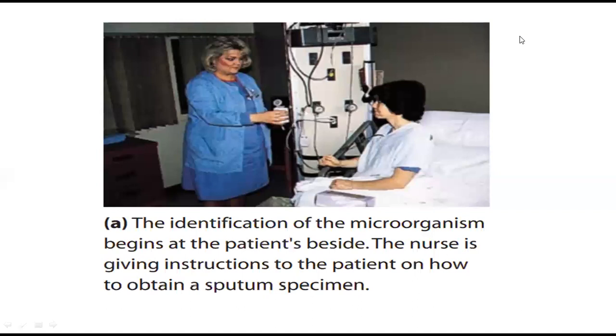For example, you are working in a laboratory, and you are asked to collect a sample from a patient. Okay, there is a patient. In this slide, I will discuss how you will take the sample from a patient. For example, if you are testing his sputum, you have to collect the sputum from his nasal cavity or from his mouth through a sterile swab and place it in a tube. Or if you are testing his blood, you have to draw the blood through a syringe, and after that you have to pour the blood in a vial, and then you have to test it.